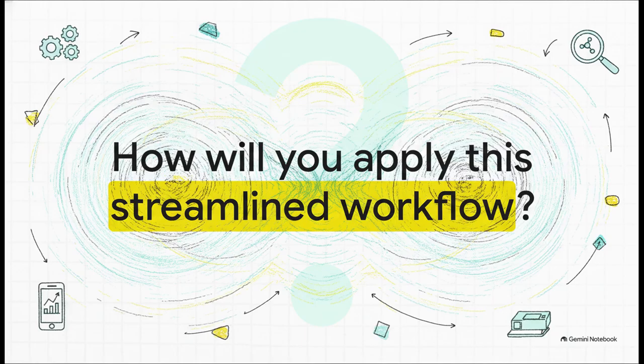And there you have it. You've just walked through the seamless step-by-step journey from initial login and calibration all the way to advanced scanning techniques and final data analysis. The Sagitto app really is designed to make complex spectroscopy totally accessible right from the smartphone in your pocket. So I want to leave you with this thought. Now that you know how to wield features like batch mode, continuous scanning, and auto prediction, how are you going to use these tools to completely transform data collection in your own field?